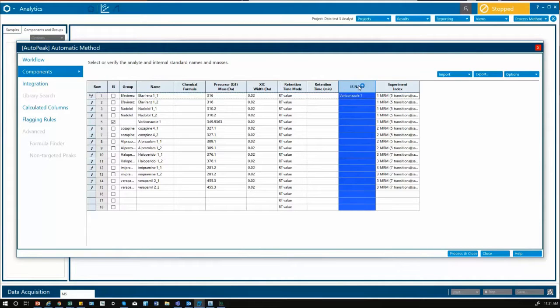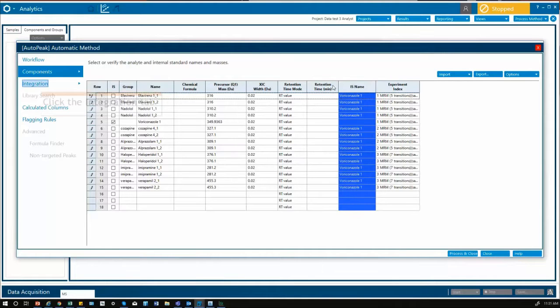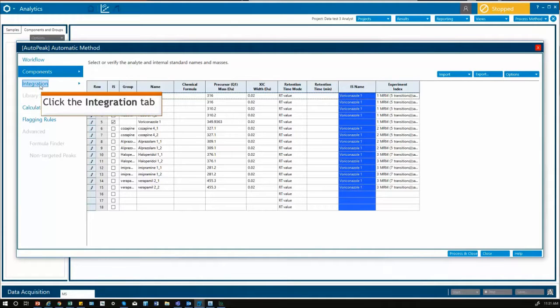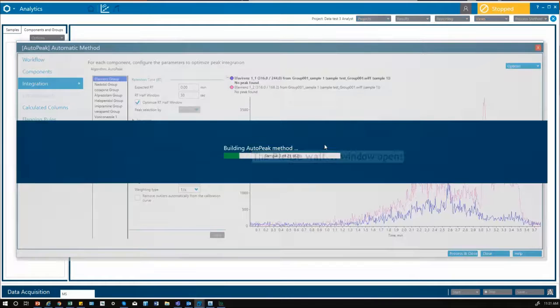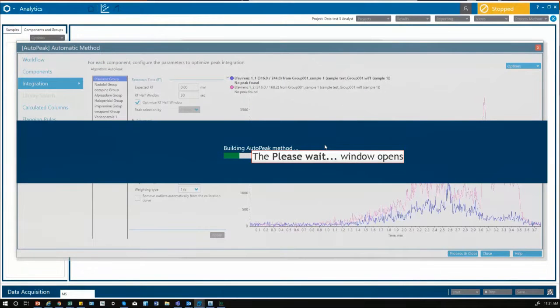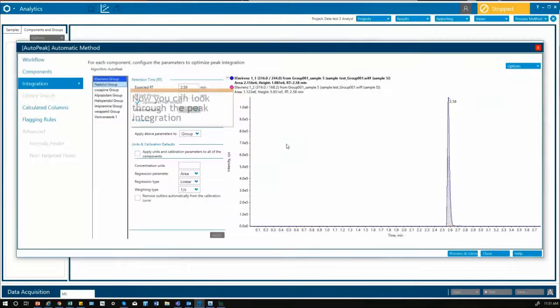Then we can go to the integration tab and integrate our samples and view our integrated peaks.